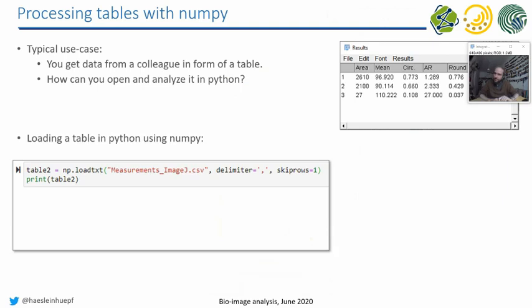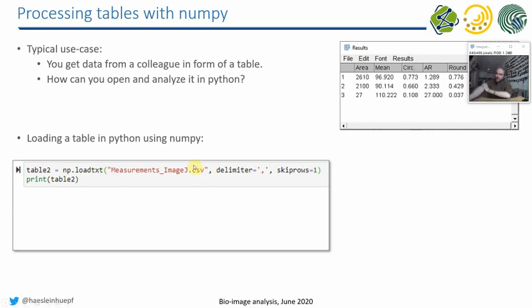NumPy is one of the potential answers for that, the one I introduced you first to because you are already used to NumPy now. It has a function called loadTXT. So you can enter here a CSV file, so this is the files we saved during the past weeks in ImageJ. And you have to specify a delimiter, comma.